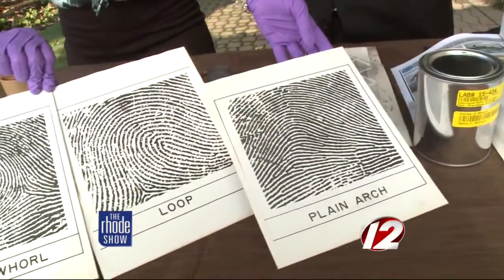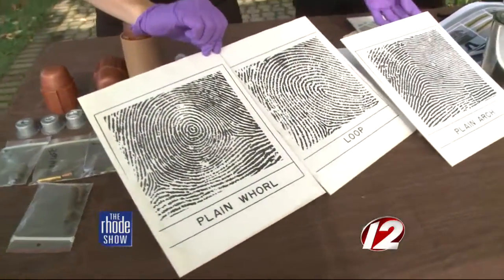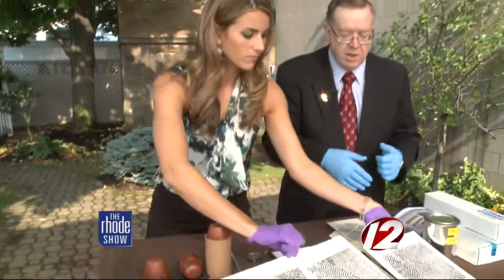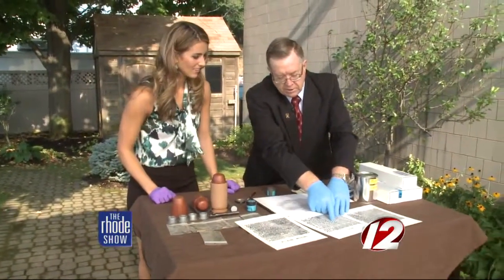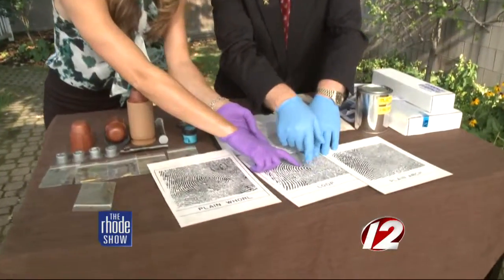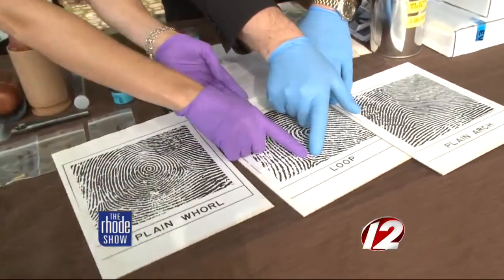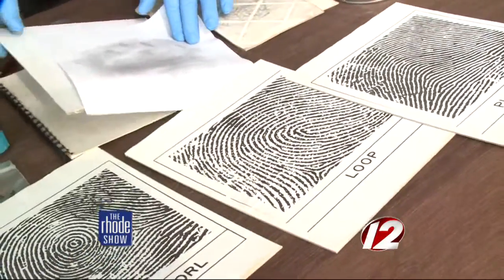Each finger has a different pattern for you. Some people might have more of a loop, some people might have more plain arches or whorls, but that's the primary pattern. Then secondary patterns are where you see these two lines come together — bifurcations, ridge endings, little islands — they just kind of make these little shapes here.